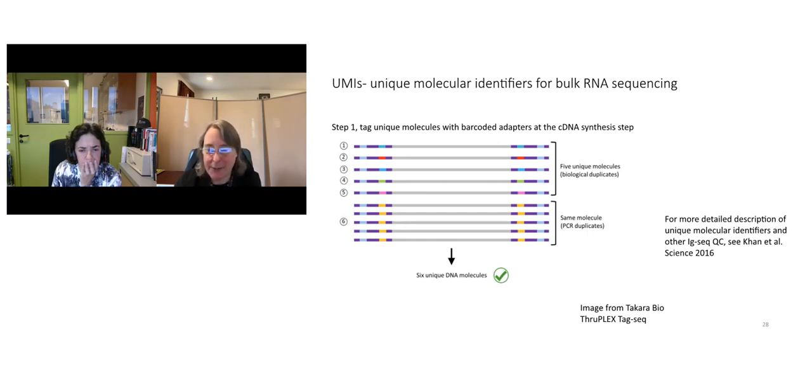In this illustration, there are 6 unique molecules. 5 of them are present in 1 copy and have these different tags that are blue, red, green, etc. And then this more frequently encountered template, maybe it was from a plasma cell or something, has several copies. So this is the first step in this UMI workflow.